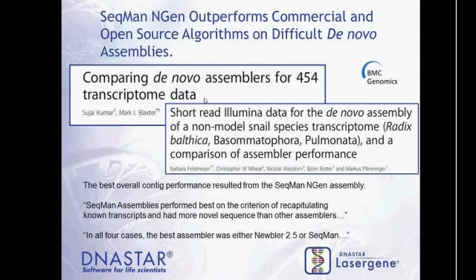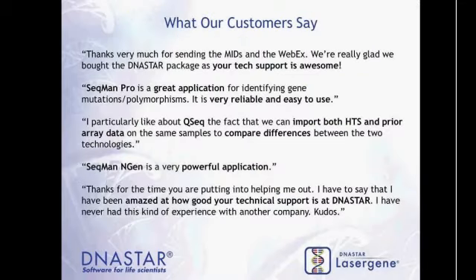And so we have very fast reference-guided assemblies. Our de novo assembler is very stringent, very accurate. Again, these all run on desktop computers.